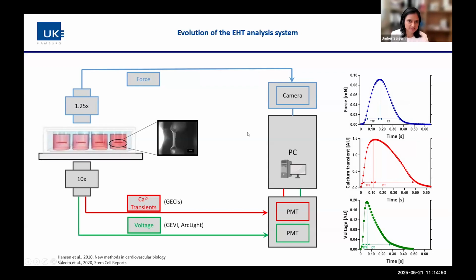So we have previously established an automated optical testing system to analyze contraction force of the beating engineered heart tissues by making videos of these EHTs, which are then analyzed by figure recognition software. And then these force peaks are generated, and from these force peaks we can calculate peak force, time to peak, and relaxation time.